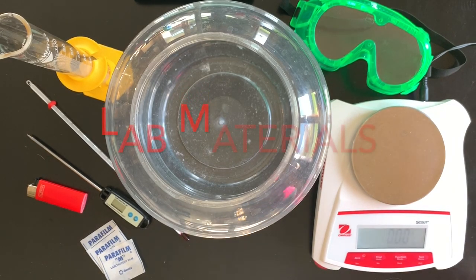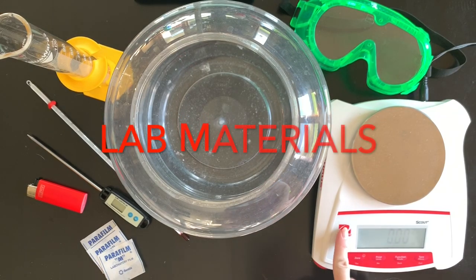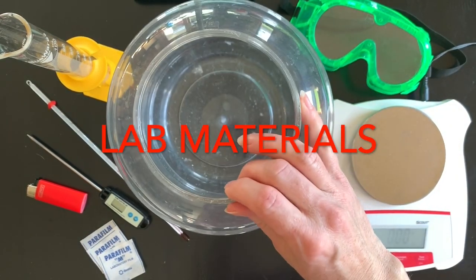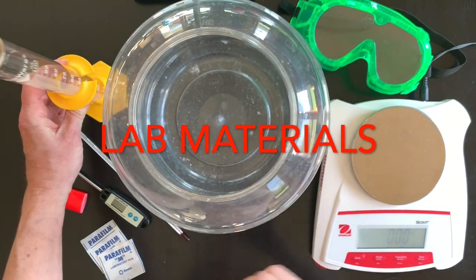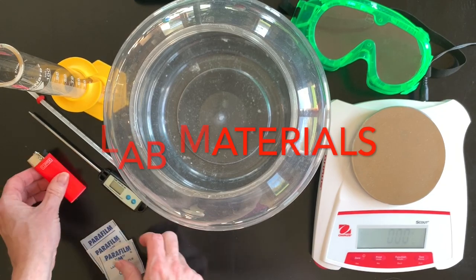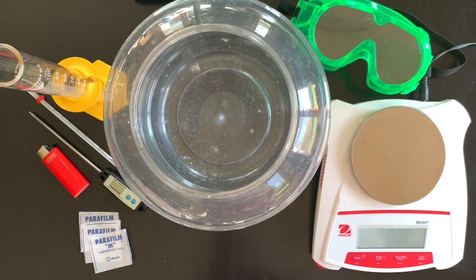Your lab materials for the molar mass of a gas lab are a balance, goggles, a water basin, a graduated cylinder, a thermometer and maybe a digital thermometer, a lighter, and some parafilm.